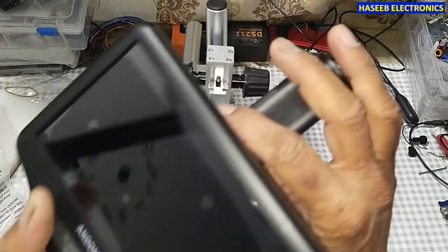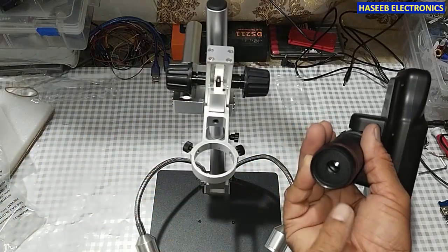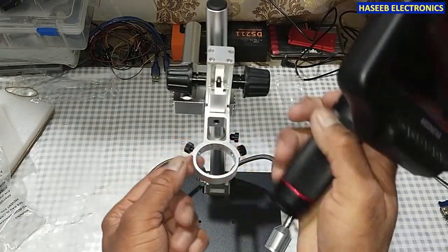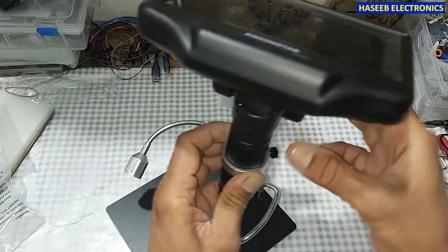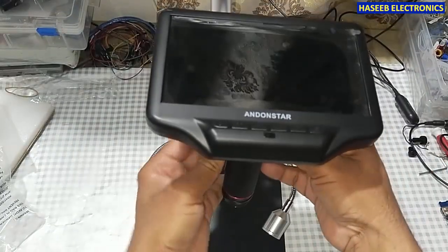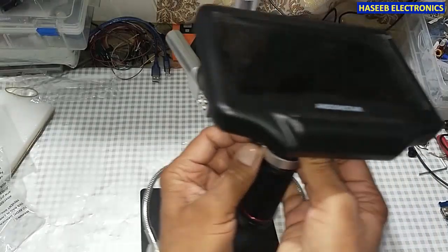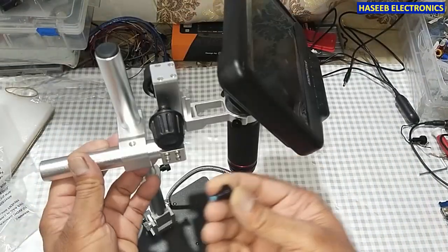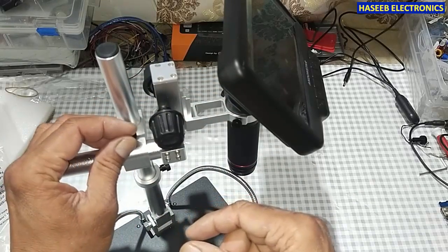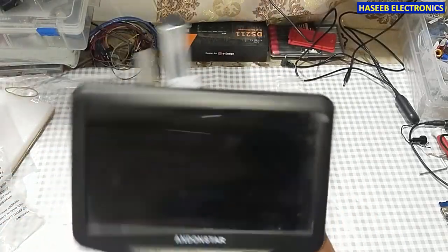Now let's have a look at the camera. This is our display — it is a 7-inch display — and here is the sensor, a 4-megapixel camera. Just loosen these two screws and insert this camera here, then tighten both colored screws and these knobs.